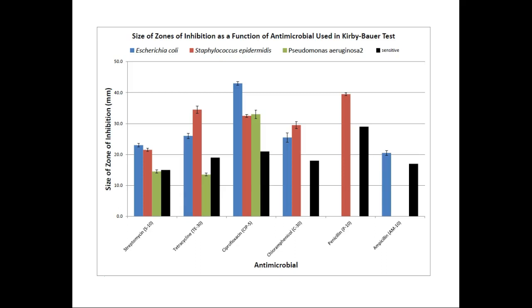So take-home message, right? We know that these drugs work in different ways, especially with penicillin. It really depends on what type of cells you're using and what type of penicillin, right? Whether it's been modified or not. All the ones that end in -cillin are modified penicillins, amoxicillin, ampicillin, right? So some of them can work against gram-negatives because they've been modified. Some bacteria are resistant, as we saw, right? Pseudomonas was resistant to a lot of the drugs. Just one of them was it actually sensitive to.